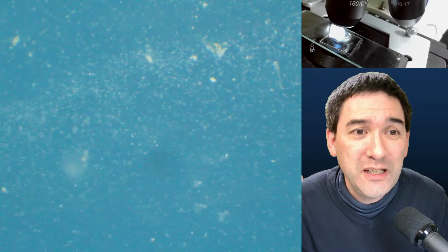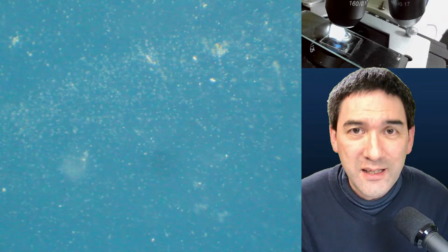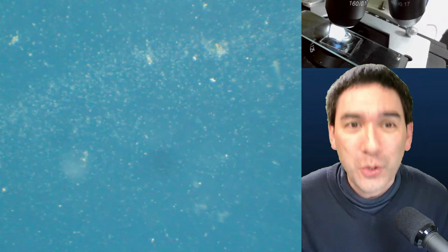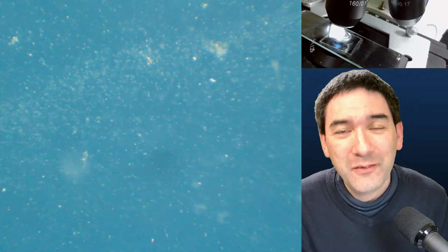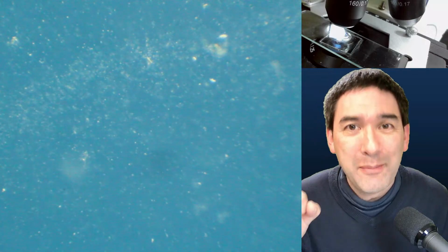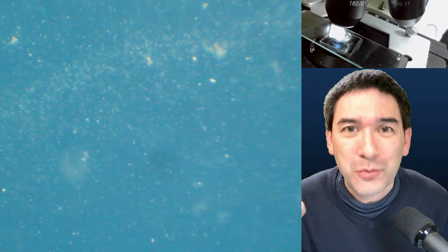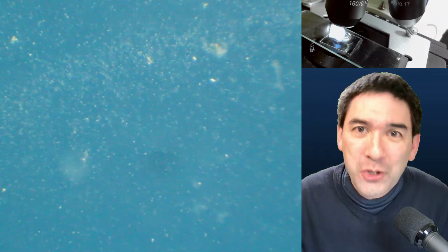So this is also interesting to see that dark field allows you to actually visualize things that you normally would not be able to see simply because it increases the contrast so much. But still, even though it's below the resolution limit, you're still not violating Abbe's law, which basically sets the limit of resolution, because we're not able to see structural details. So it's basically we're seeing a fuzzy spot which is larger than the virus.